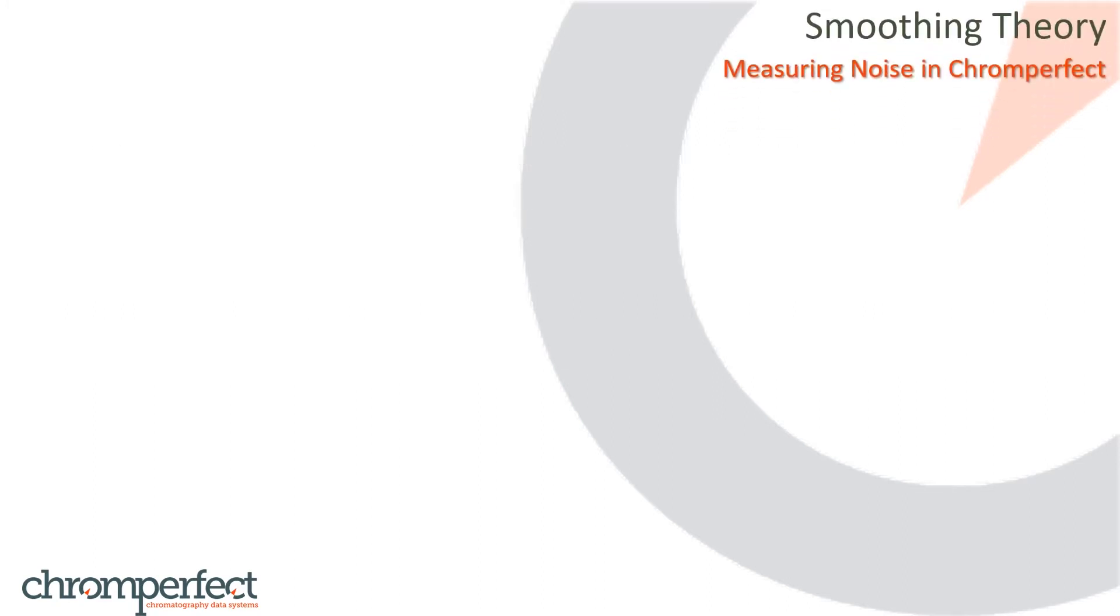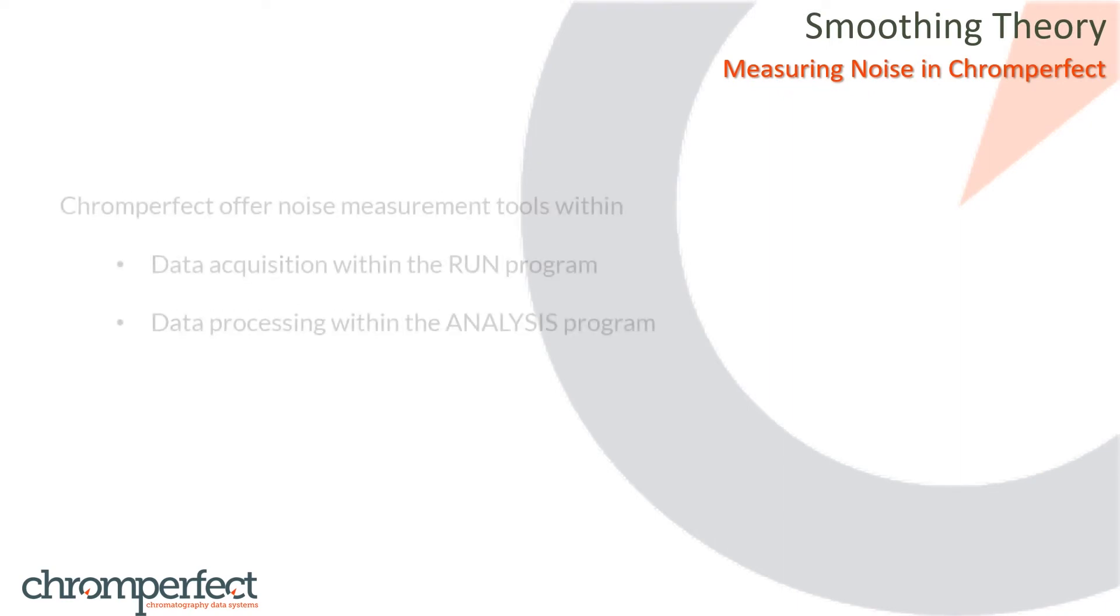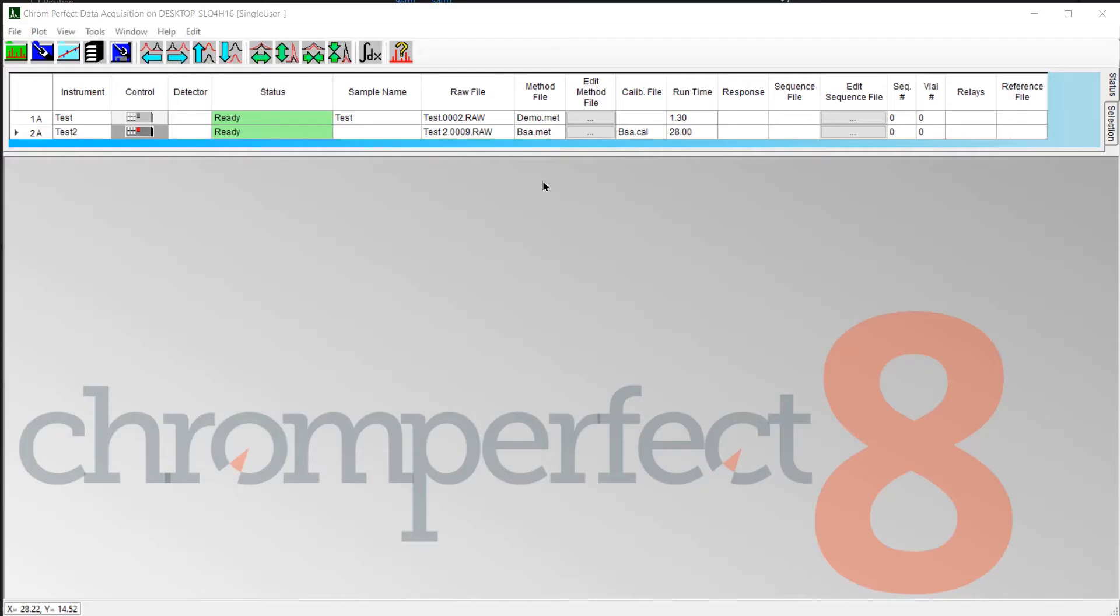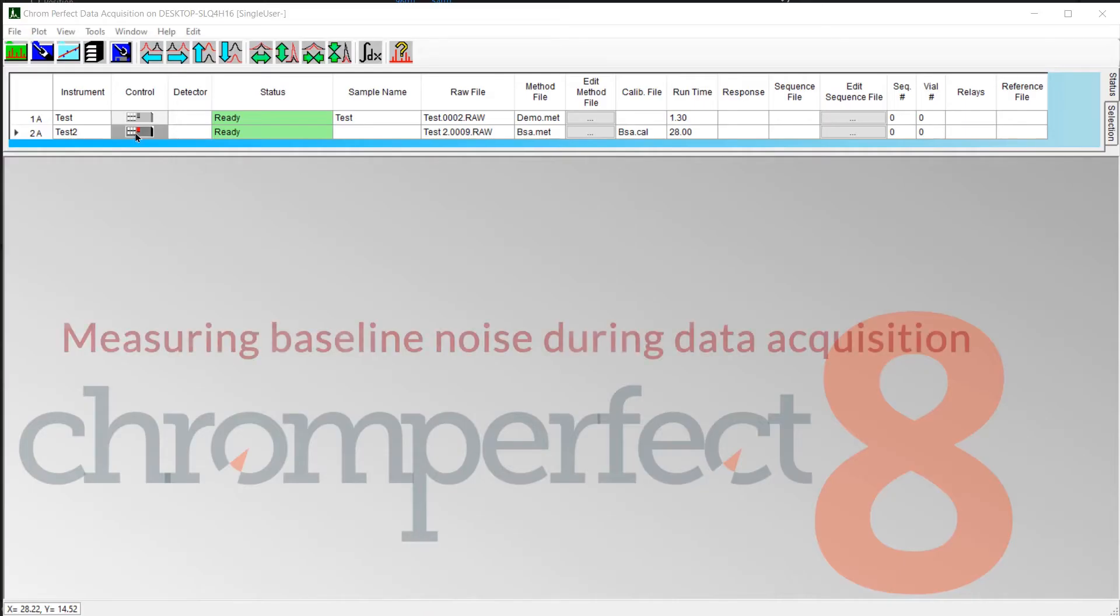ChromePerfect supports noise measurements when analyzing or processing chromatograms and in real-time plots during the data acquisition phase. There follows a quick demonstration of how you would use the measure noise feature within the software.